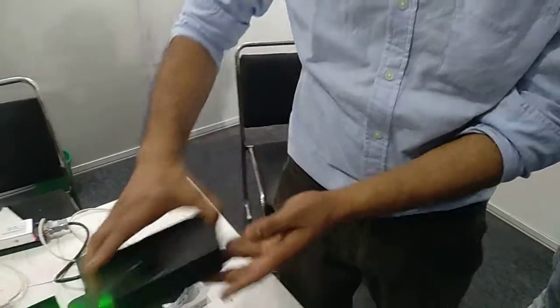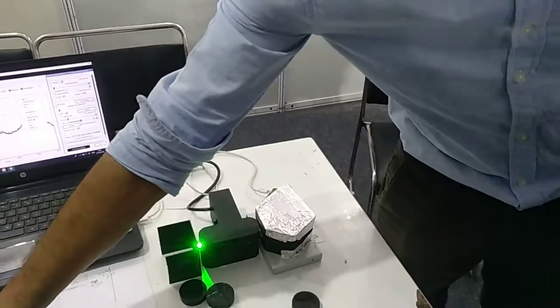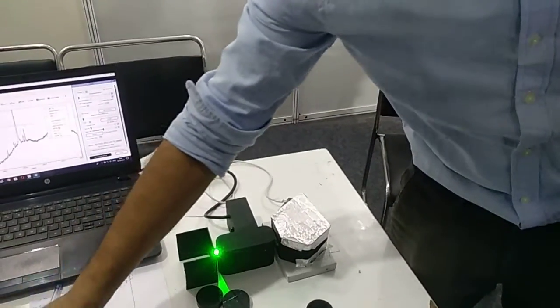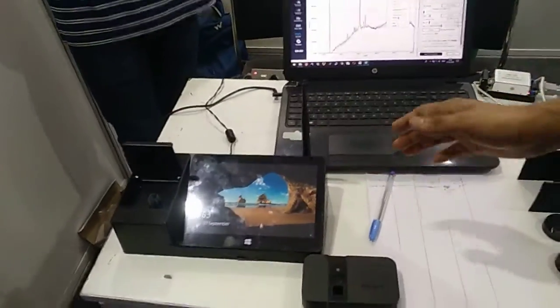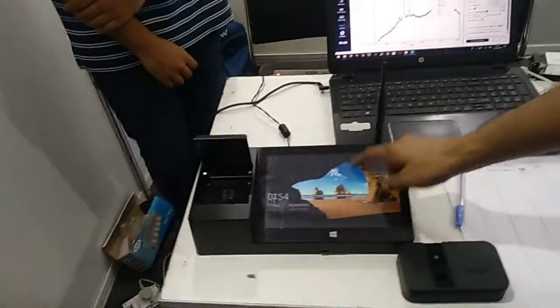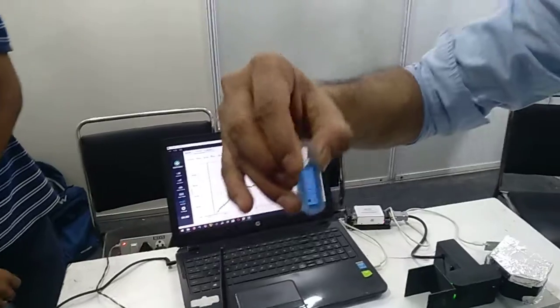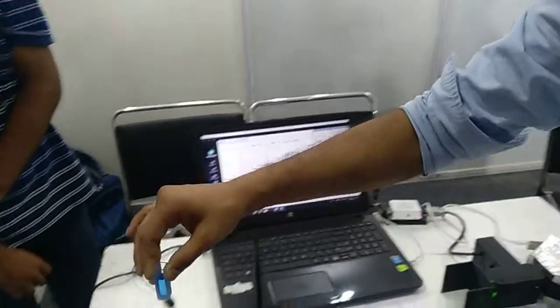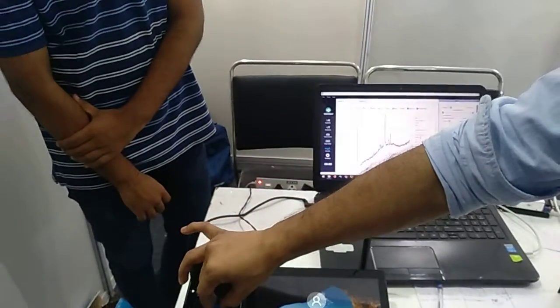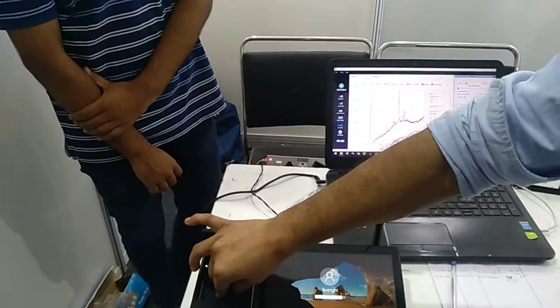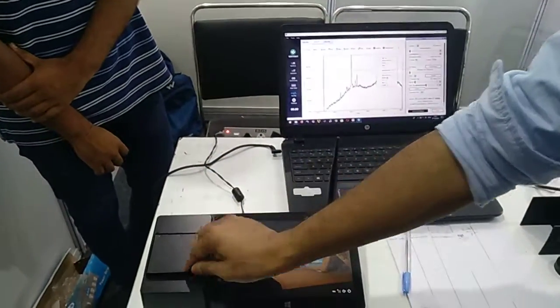This is the other product. We have added a touchscreen. You can sample it and see results.